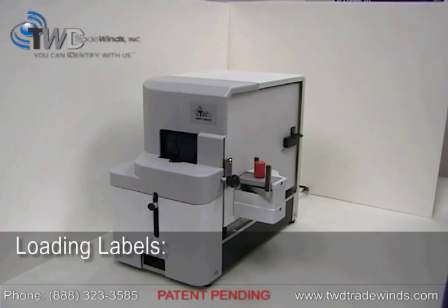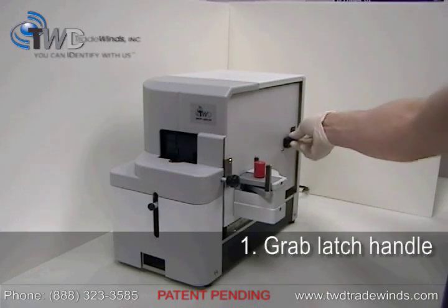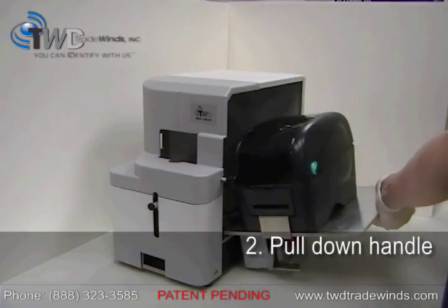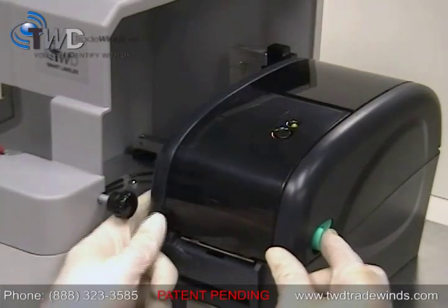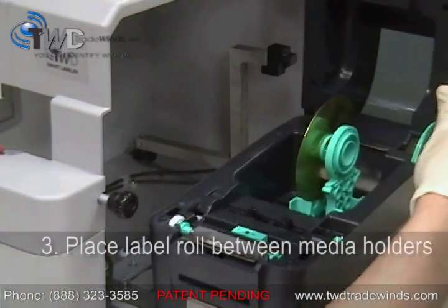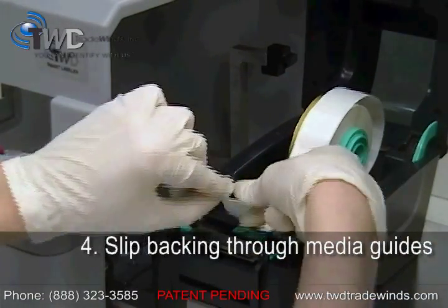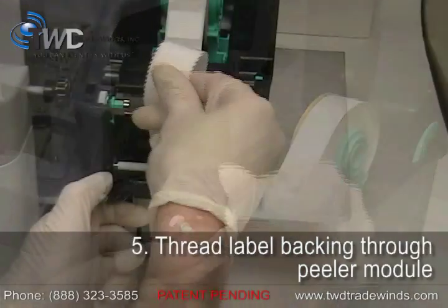Loading labels into the Smart Labeler is easy. Simply grab the latch handle and pull down to move the printer into an upright position. To load the label roll, just place it between the two media holders, slip the label backing through the media guides, and thread it through the peeler module.